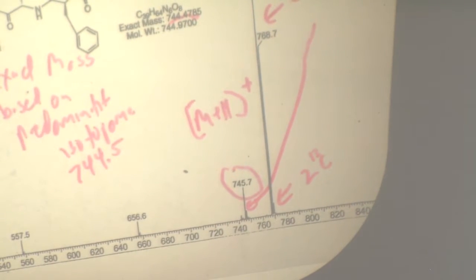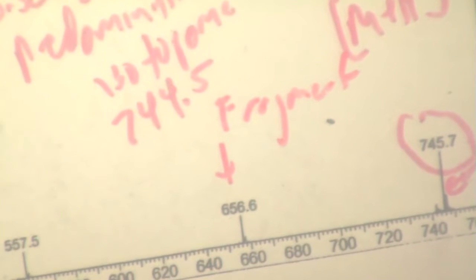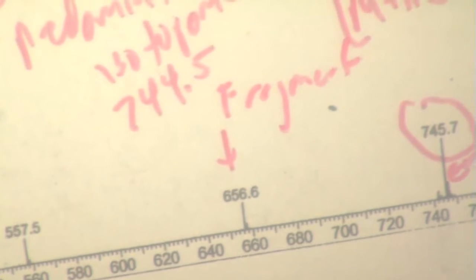And you'll notice you even see molecules with two C13s. We typically don't get a lot of fragmentation in the mass spec, but you'll see, for example, here you have a fragment. You're doing acid chemistry on the molecule. What's happening in generating the fragment is you're protonating on this nitrogen, and then it's leaving for that particular fragment to generate an acylium ion.